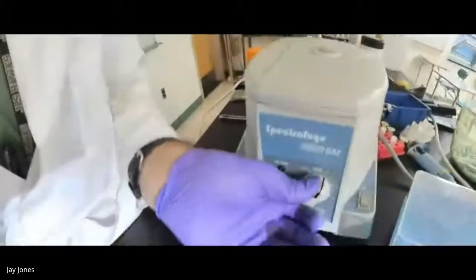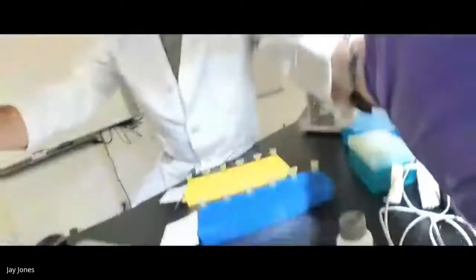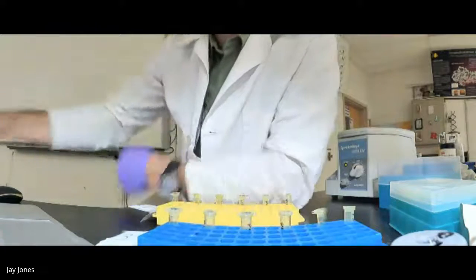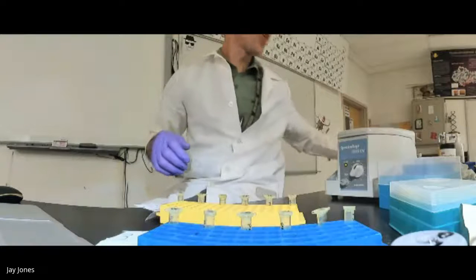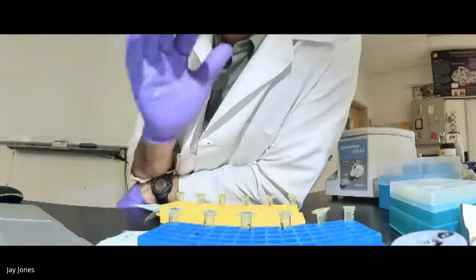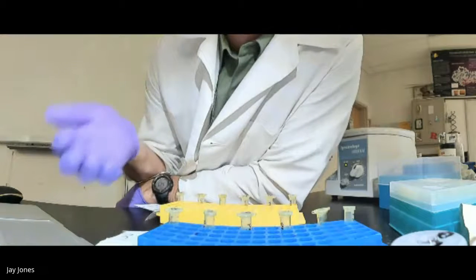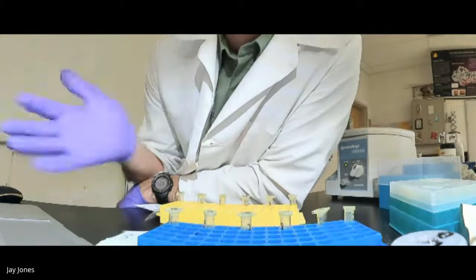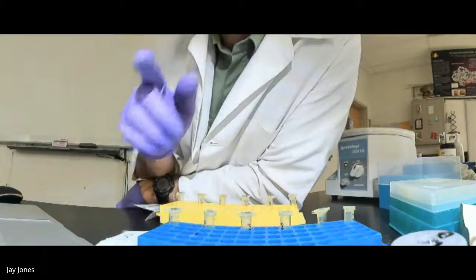Let's talk about what happens here. Okay, so the wash buffer is really interesting. The wash buffer is ethanol. It smells like ethanol. What's cool about the wash buffer is that it's polar. Ethanol is pretty polar. It has a hydroxyl, if you guys remember. It's CH3CH2OH. It's two carbons and a hydroxyl with H's everywhere. And that's a polar molecule. Ethanol can dissolve in water. But ethanol is not as polar as water.